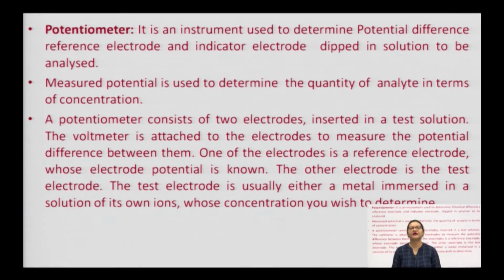One electrode is a reference electrode whose potential is known, is stable, and is quite insensitive to the analytical solution, which is very stable. We will study this in depth in our coming slides, in our next PPTs.